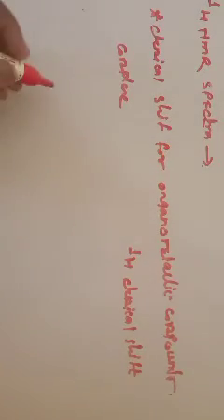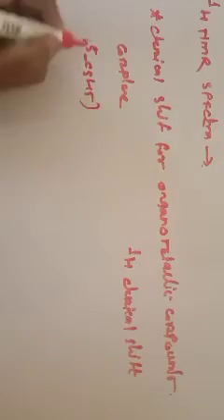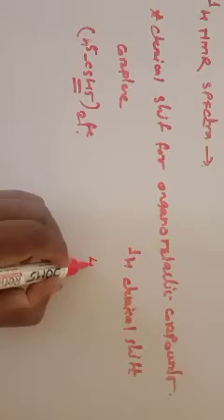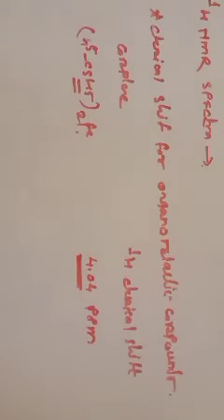Again, if you consider the next one, that is your ferrocene complex, that is eta 5 C5H5 twice, and this is your Fe. And for this proton, the proton which is attached to the cyclopentadienyl ring in ferrocene, its value is 4.04 ppm. So the delta value or chemical shift value for this eta 5 C5H5 is 4.04 ppm.